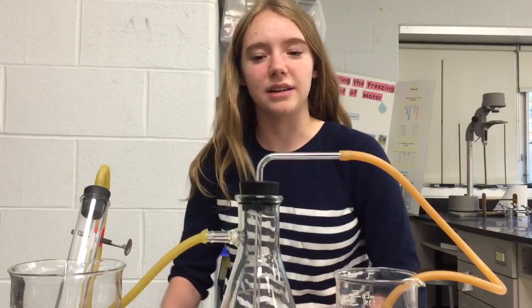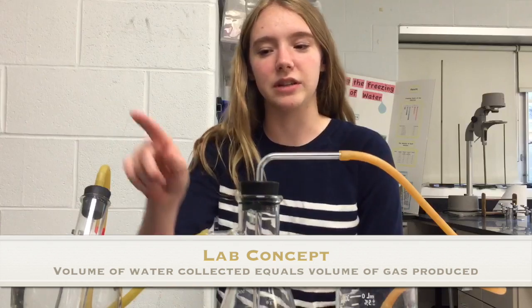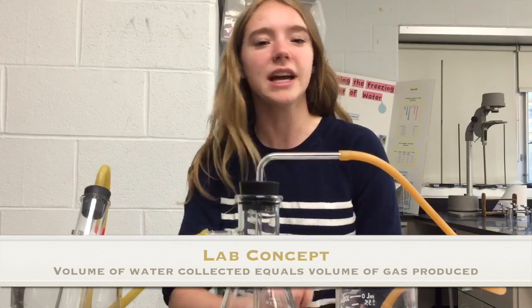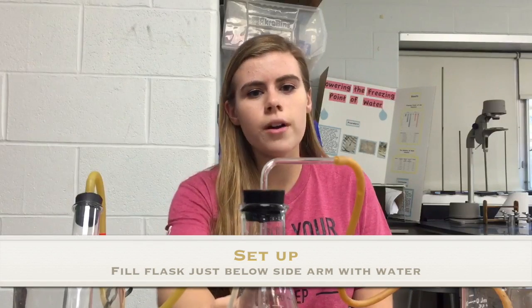The theory behind this lab is that the hydrogen gas produced by the reaction in the test tube will push water through the flask into the collection beaker, and the amount of water collected should equal the amount of hydrogen gas produced. The first thing you should do is fill the sidearm flask almost all the way up to the sidearm with water.